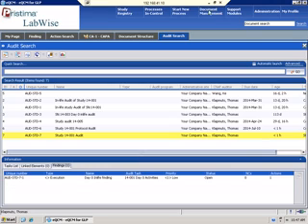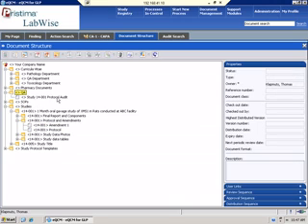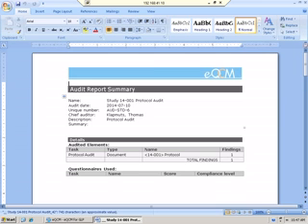I have an example of a report I generated earlier today. I'm going to my QA group. We have the protocol audit. Again, it automatically loads it into the document management system. And so because it's not the final report, it's not distributed, so it's a working version, and I can modify the document. So I can just click on it, open it up, and make changes. This is our out-of-the-box. We can take this information and apply it to any Word report you may have, or you can expand on this template and add additional textual fields to it.